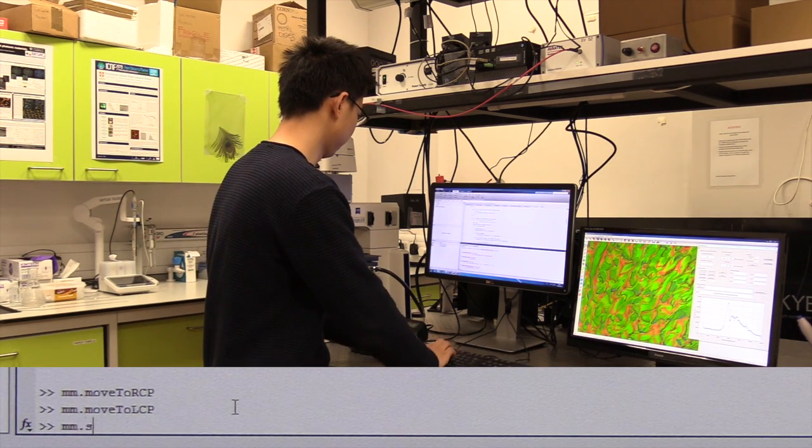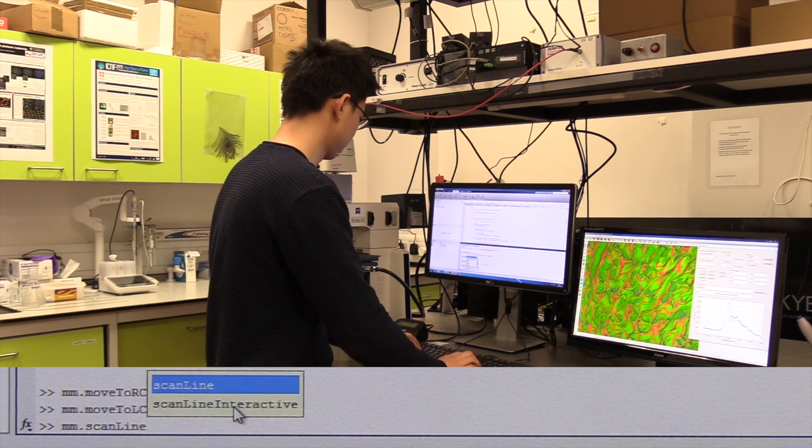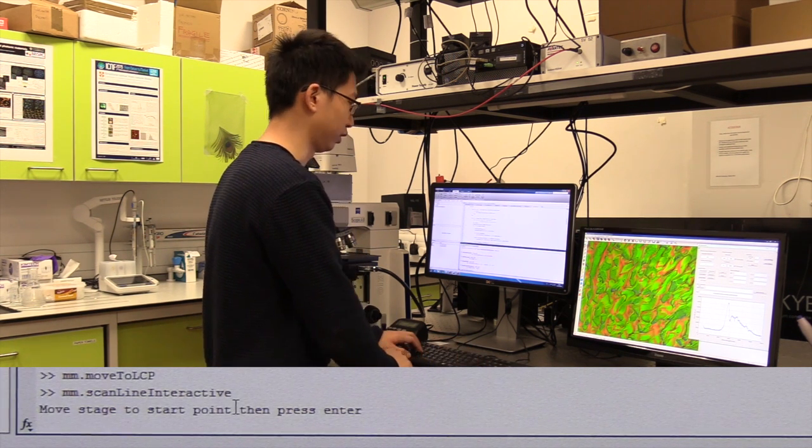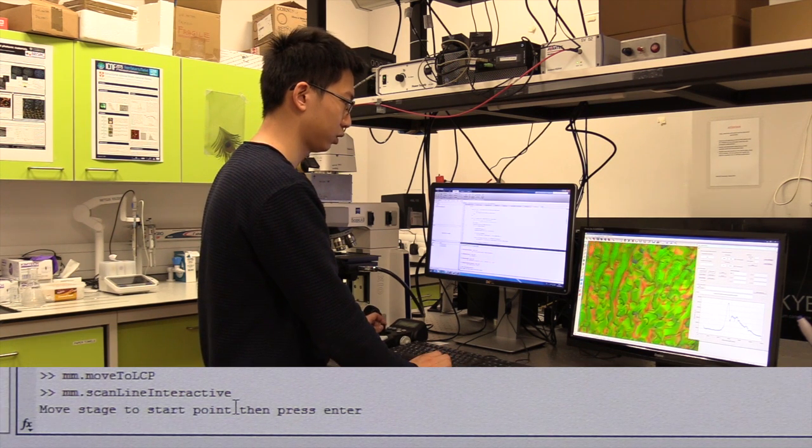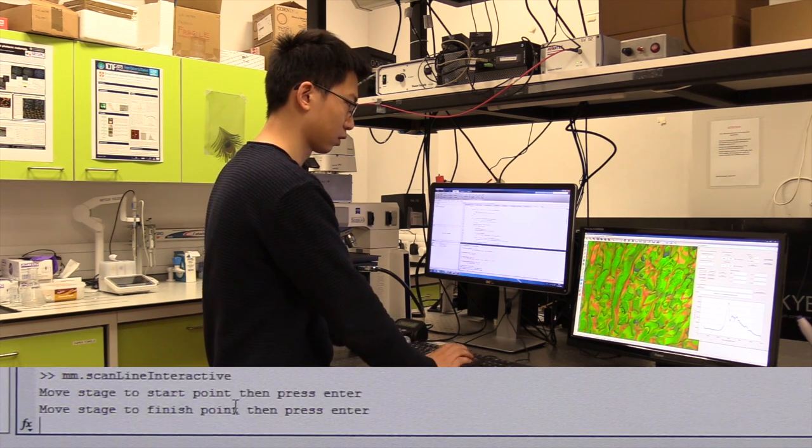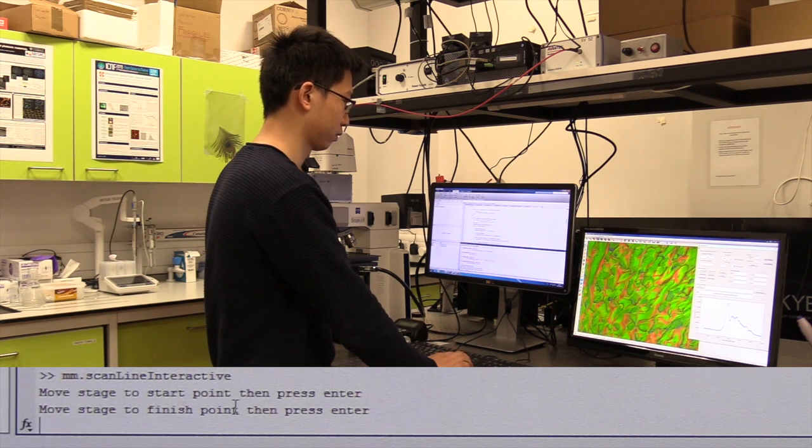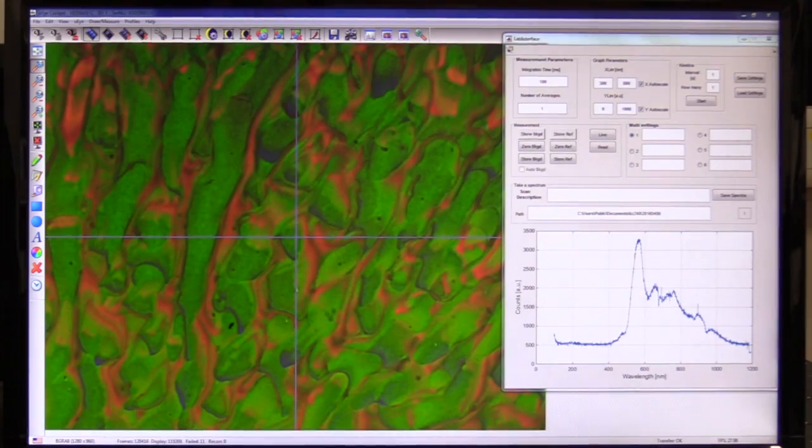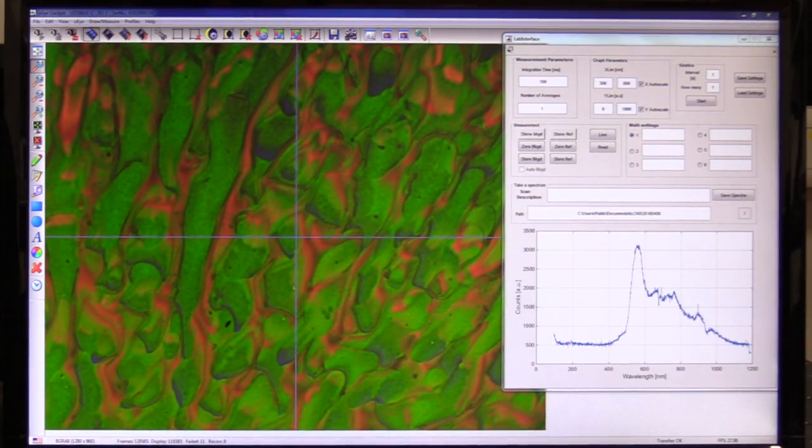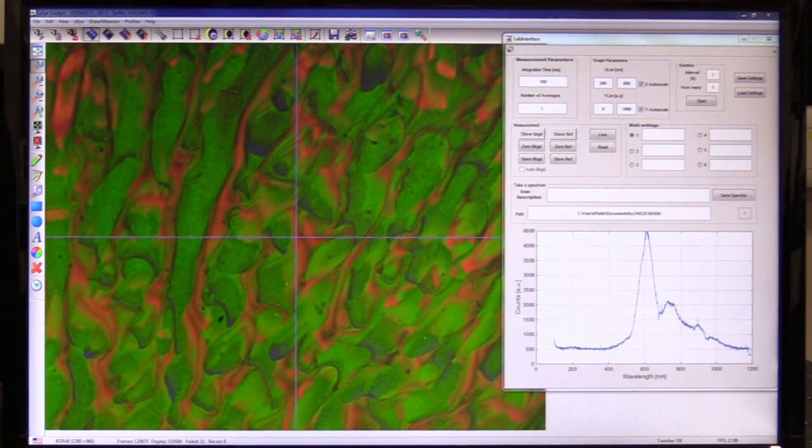To do that, type in scan line interactive, move to the starting point, press enter, and move to the finish point. Now the movement of the stage will allow you to scan from starting point to the finish point.